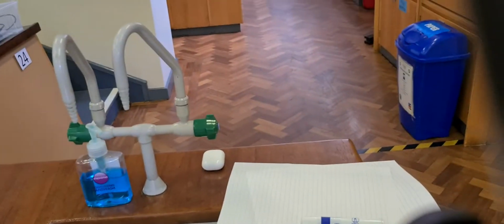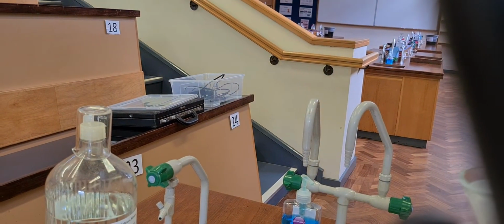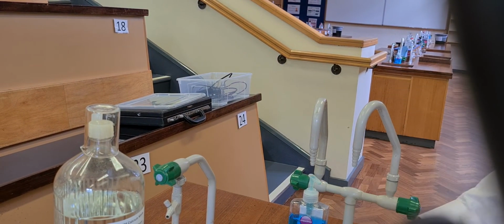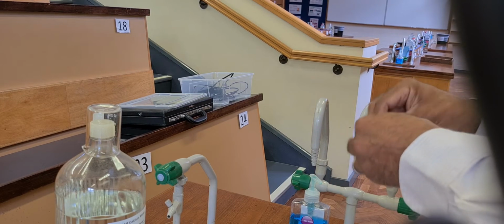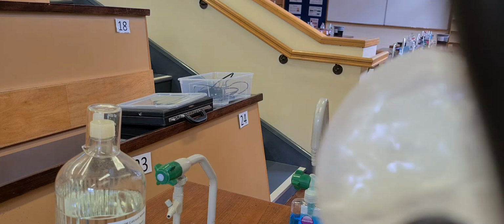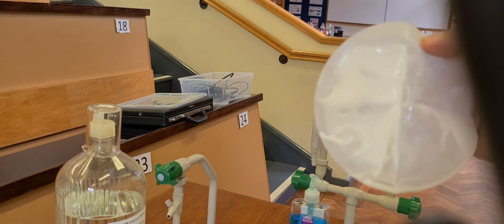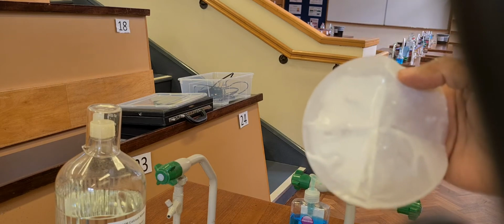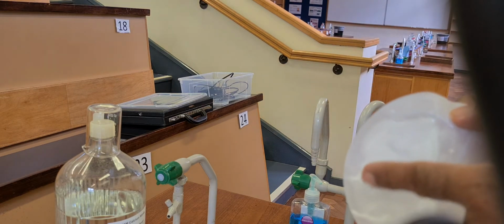Now, can I show you this beaker here? This is the residue. Let me just take it out. That there is that filter paper that I've taken out of the filter funnel, barium sulfate.